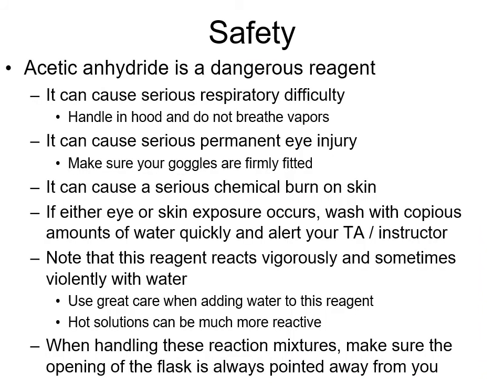And as I mentioned earlier, this is a very dangerous reagent, the acetic anhydride. Remember, we're made of water. Well, not completely, but we have a lot of water in our bodies, and it's very reactive towards us. There's also other compounds in our bodies that react with it. So you want to be very careful not to inhale it. It can also injure your eyes pretty severely. It can cause serious chemical burns on the skin. So if you ever get any of it on your skin, you'd make sure you wash very thoroughly with lots and lots of water. And you would alert me or your instructor.